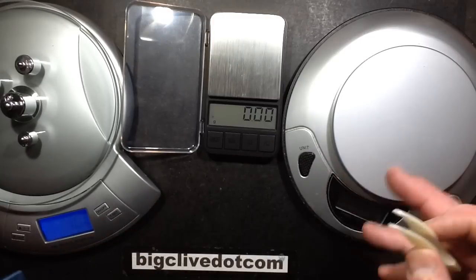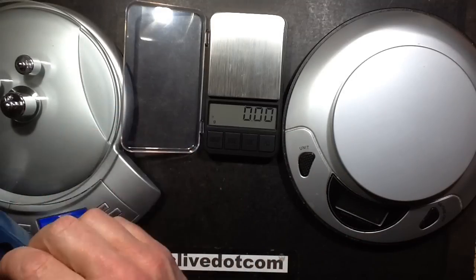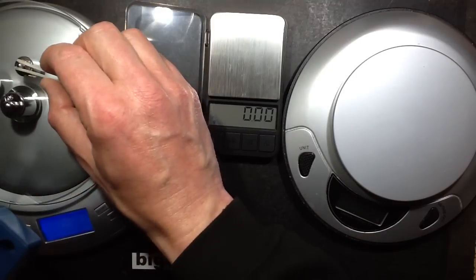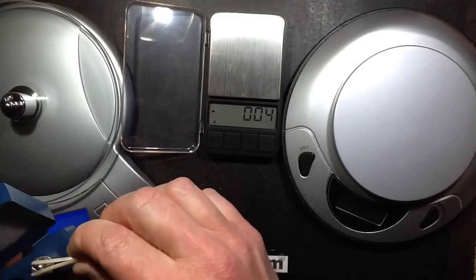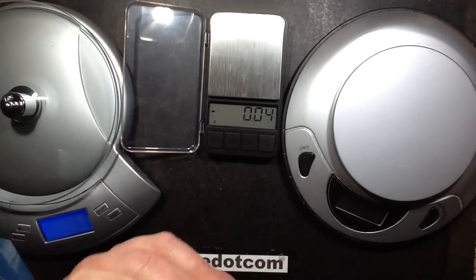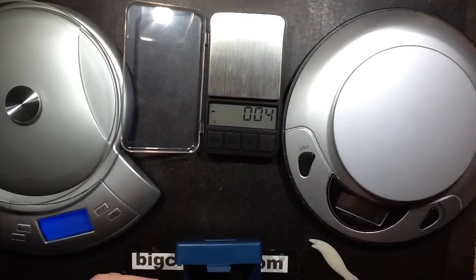I guess if it's tallying out amongst them all, then they must be fairly accurate — that's quite neat. I wonder how they actually fine-tune them. I'm guessing the reason there's a little pip on top is that the calibration gets done by unscrewing these or something — maybe they put these in afterwards. Supposedly you're not supposed to touch them because it leaves greasy fingerprints that adds weight.